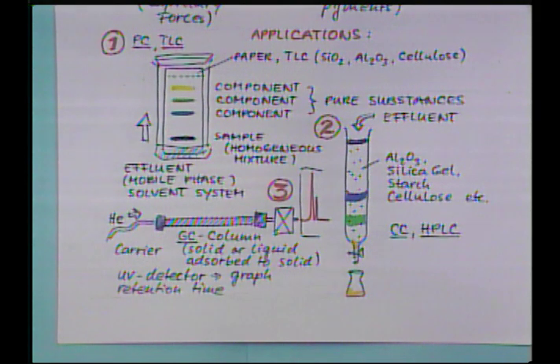of certain liquids that separate the components according to their different properties, polarity, adsorbing or adhesive type of conditions, how well they are attracted to the surface, how well they are attracted to the solvent systems. It's always a contest. What am I attracted more to? And that allows the fine resolution of the different components of a mixture.